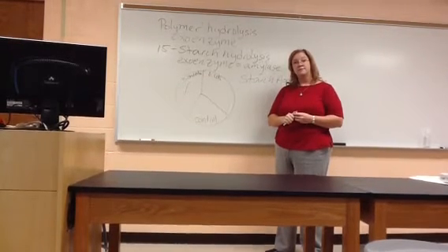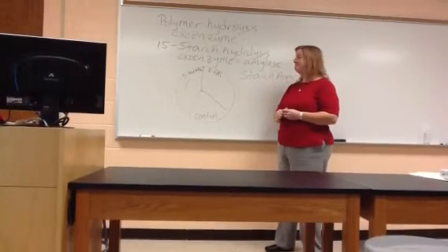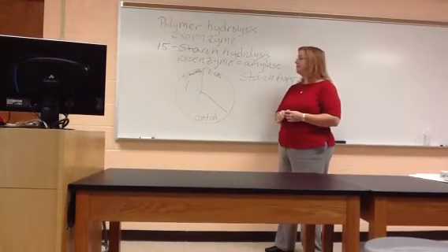Does that petri dish already have agar in it? Yes, and it's already solid. Okay. Yep, no problem.